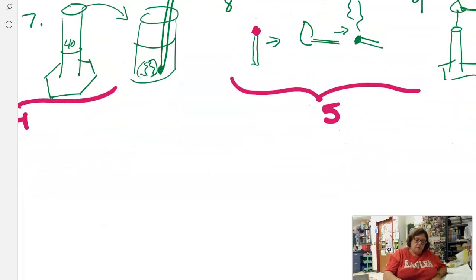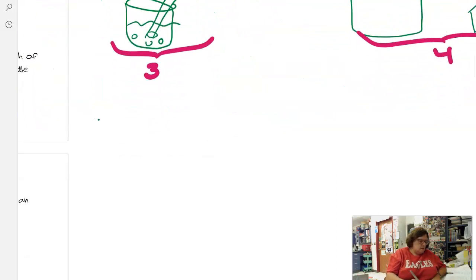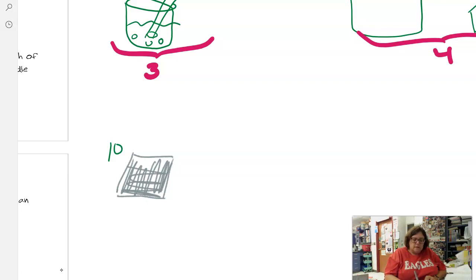Okay? So now we're going to take... A beaker. Actually, we're not going to use a beaker. You're going to take a 3x3 piece of aluminum foil, 3x3 inches. Ironic, because we should be using centimeters, which would be 6 centimeters by 6 centimeters, or 7 centimeters by 7 centimeters, actually. And you're going to kind of fold that up so you've got a little bowl.